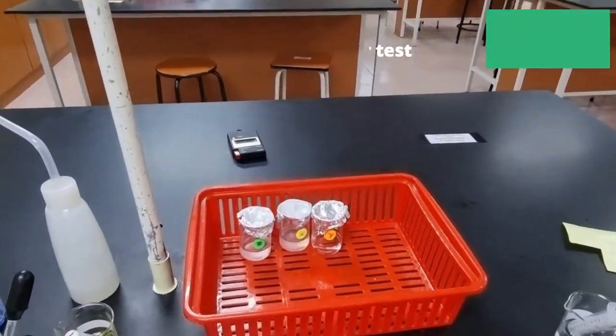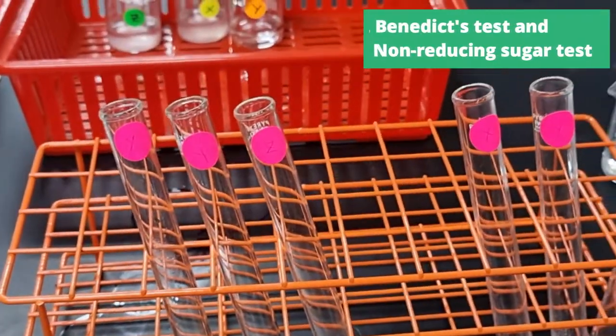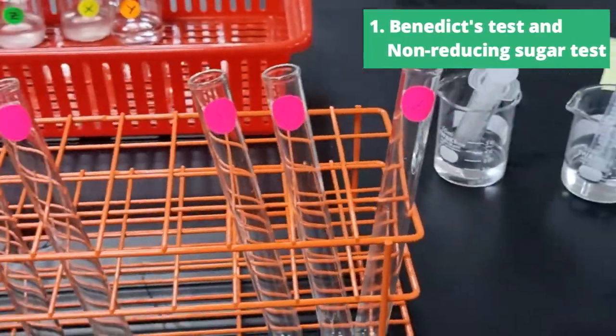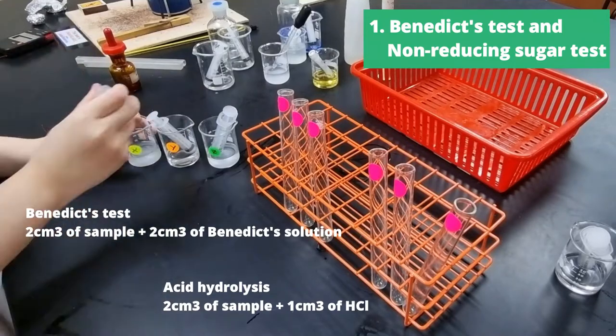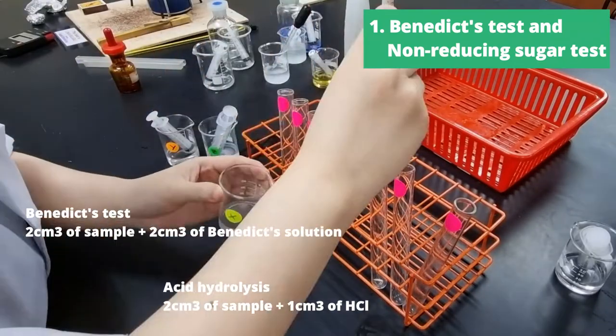So just now we were testing known solutions. Now we'll be testing solutions that are unknown to us, namely X, Y, and Z. I've prepared six test tubes here, and since the water is boiling from just now, we're going to start with our Benedict's and non-reducing sugar tests.